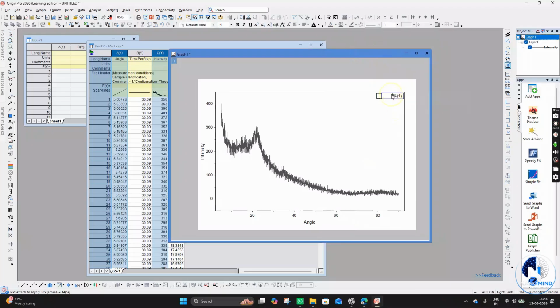The name of the sample should be changed. Whatever name, for example if I use the name GS1, here we must remove the border of the name. Just click here, go to this border and select it, and it will remove it. Now we need to change the text font and style, everything.